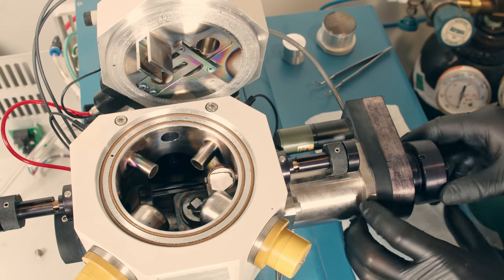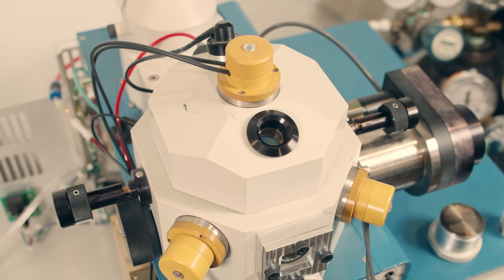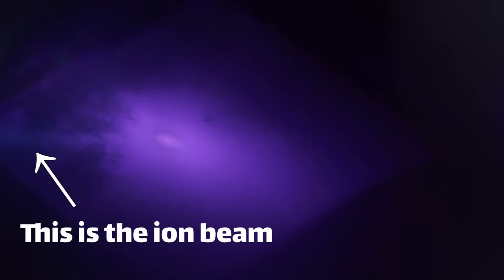The sample is loaded in, and a shield is rotated to temporarily cover the sample. In the top of the chamber is an ion gun, which generates a beam of ionized particles and is responsible for the etching. We'll talk more about the ion gun in just a second.